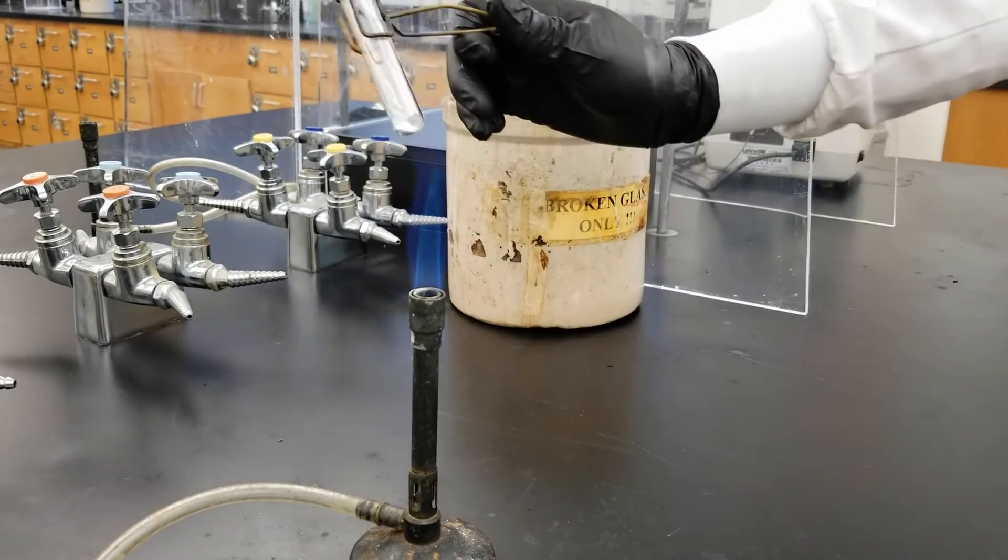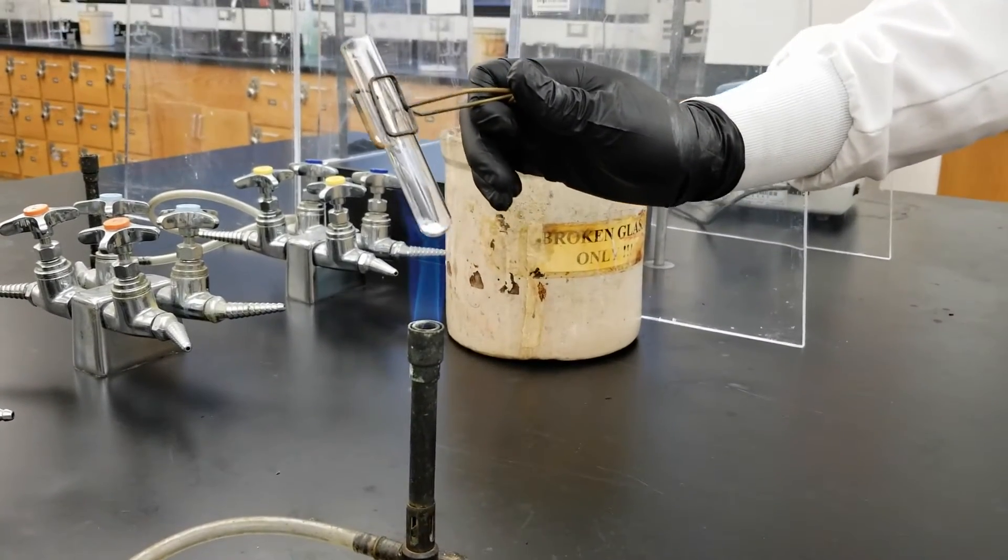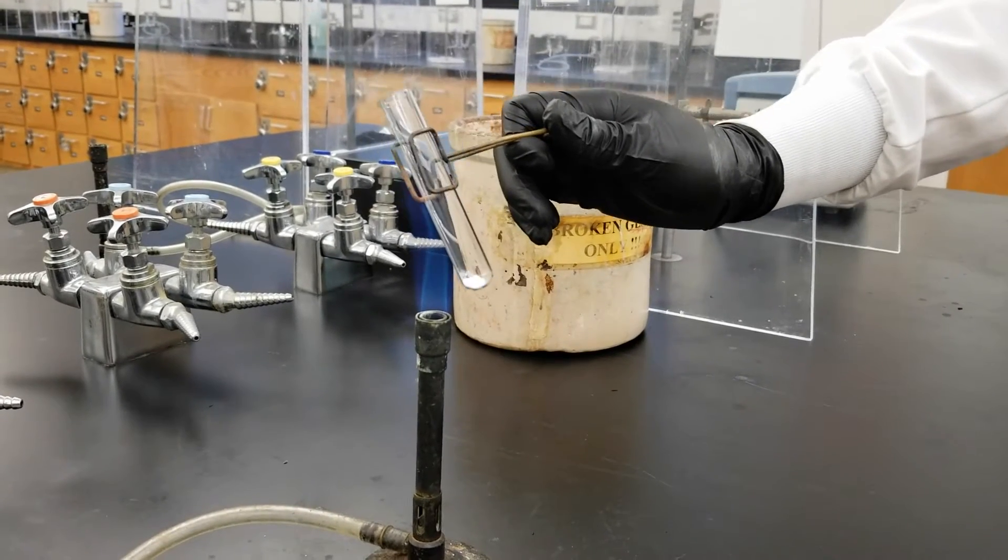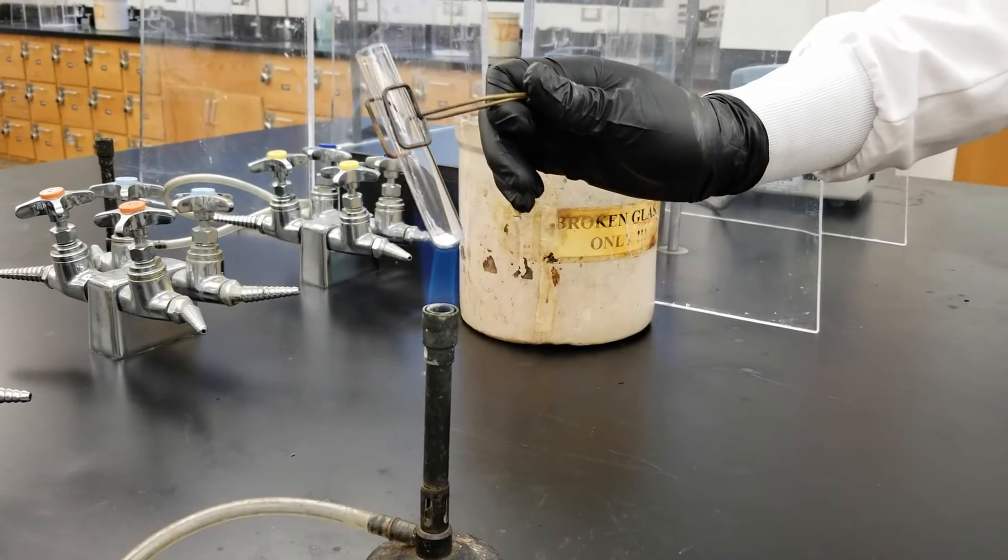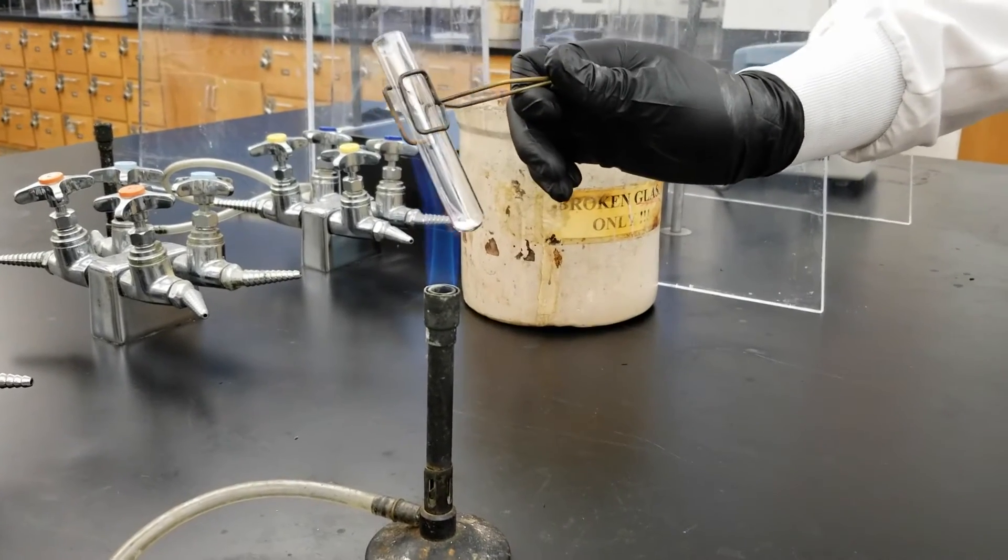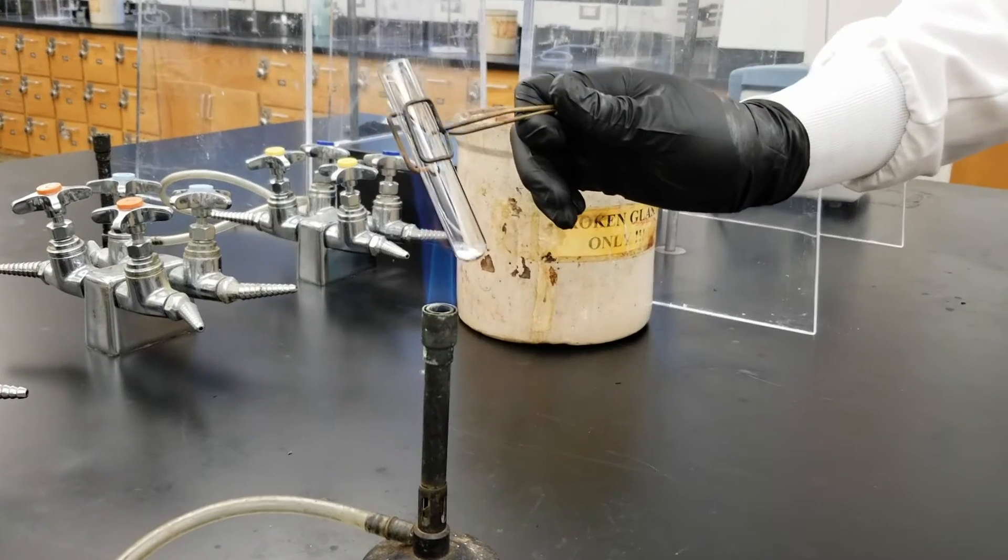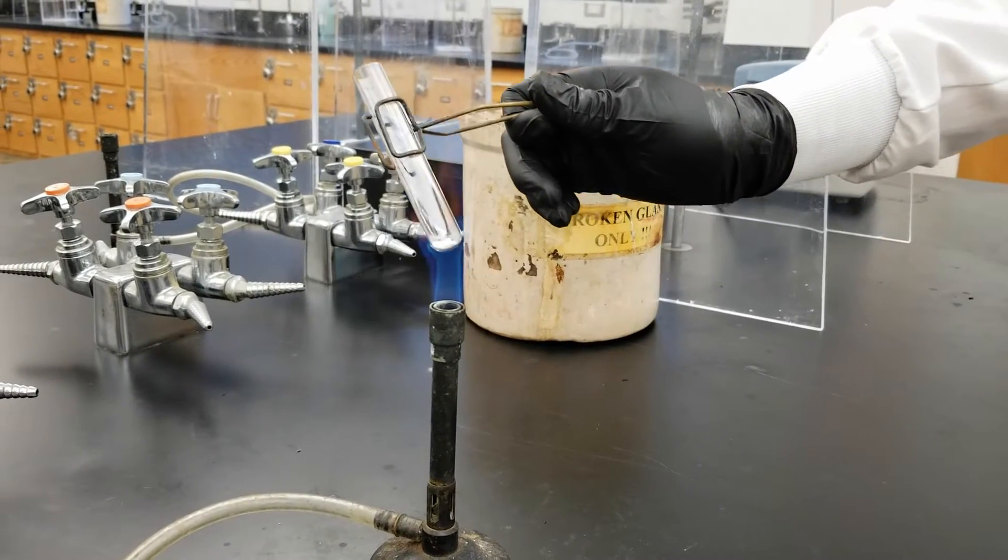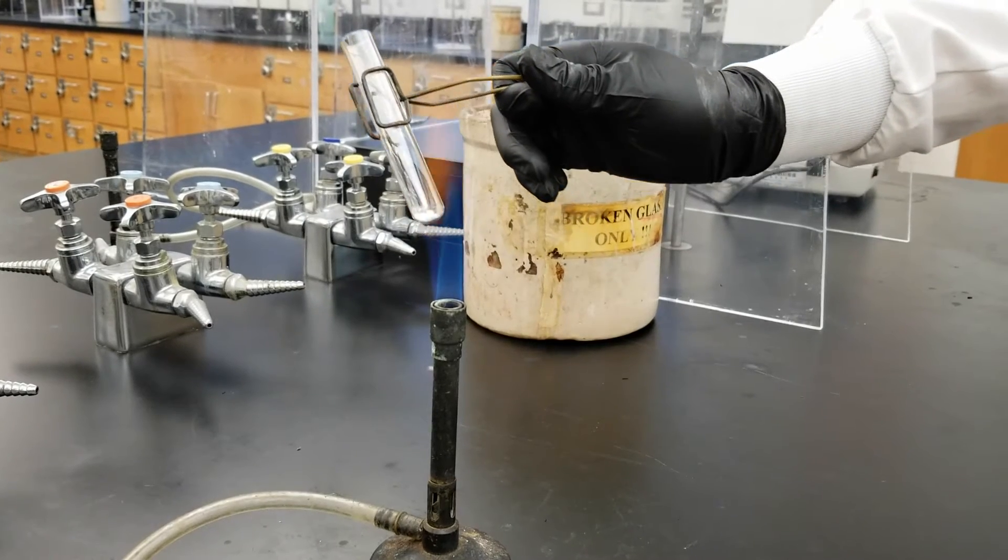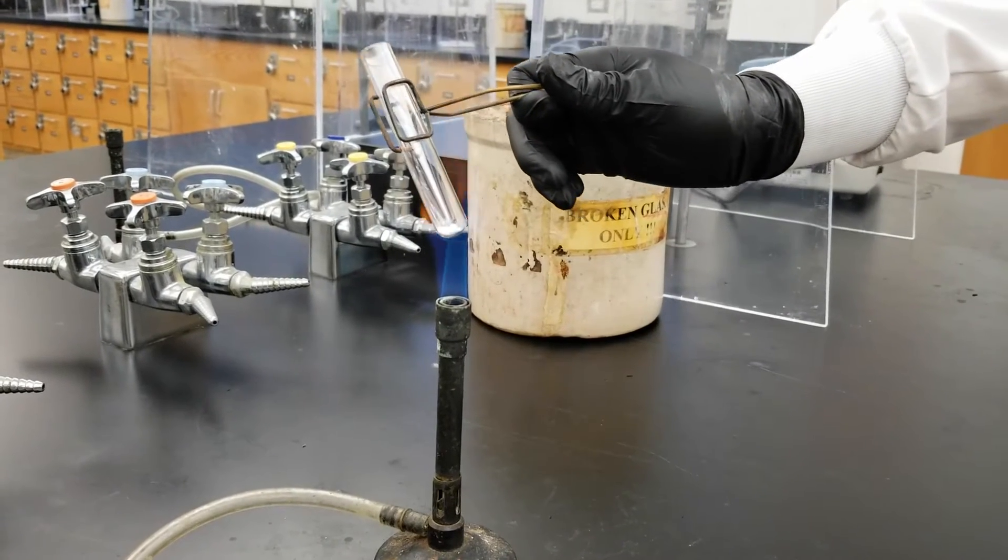To heat your test tube you'll use a test tube clamp and you'll hold the test tube at the tip of your flame and move the flame along the length of the test tube so it's not concentrated in just one spot. If it's in just one spot it can cause the glass to shatter. Also holding the test tube at a 45 degree angle will make the heating process easier. Make sure when you do this that the opening of the test tube isn't pointed at you or your lab partner or anyone else.